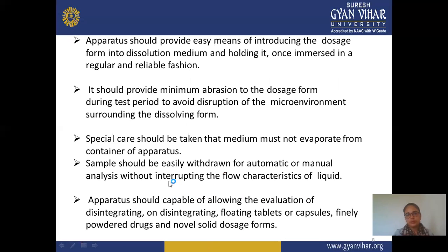So this is regarding the apparatus. Next, the apparatus should provide an easy means of introducing the dosage form into the dissolution medium and holding it once immersed in a regular and reliable fashion. Means no specific condition or technique is required for introducing a tablet or formulation into this dissolution. It gives good results when you introduce your tablet or dosage form in the medium, and after immersion it gives proper, regular results.